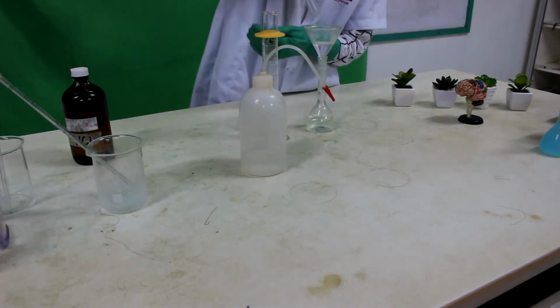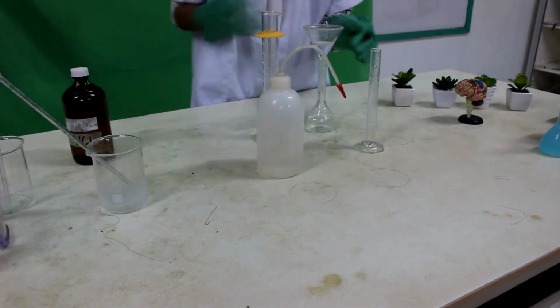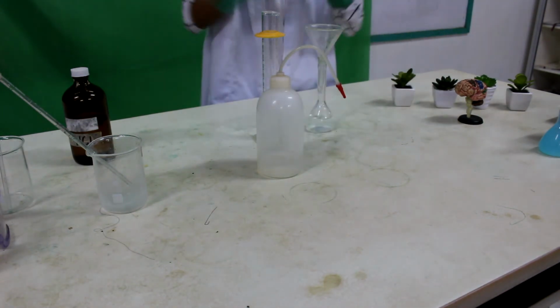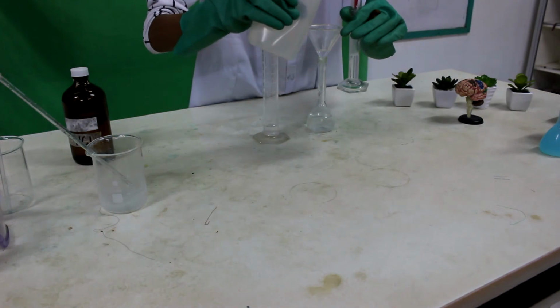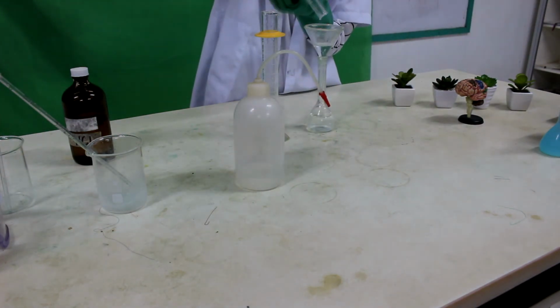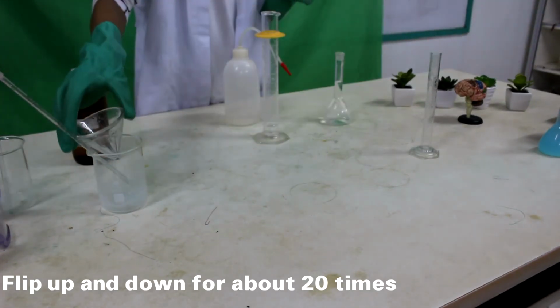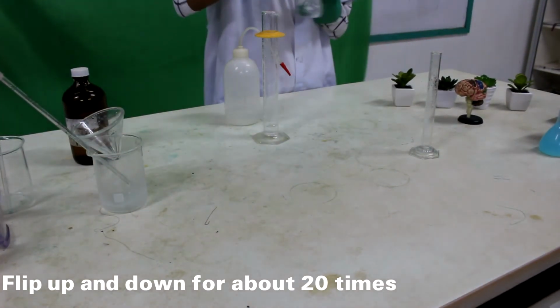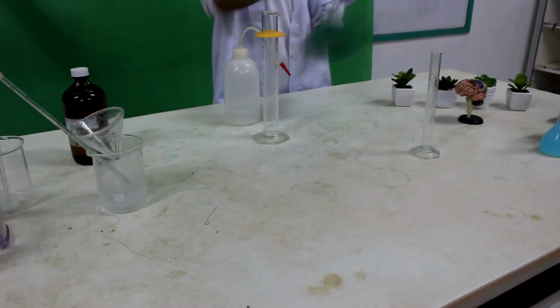Pour the remaining water so you can reach 100 ml of hydrochloric acid solution. And that is how we prepare 20% of HCl solution.